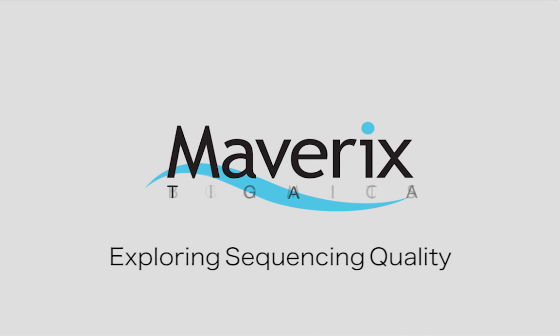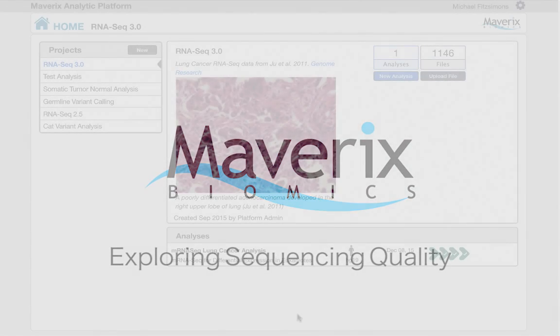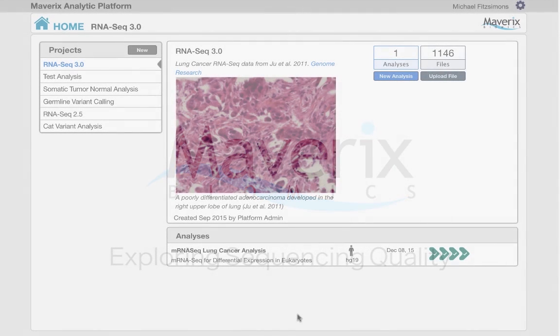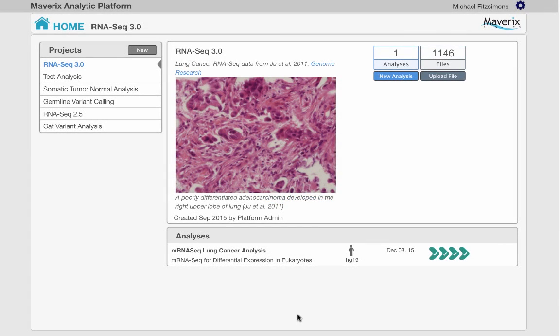Hello, let's take a few moments to go over the features in the Maverix sample inspector to familiarize you with the different ways of exploring data quality within the Maverix analytic platform.